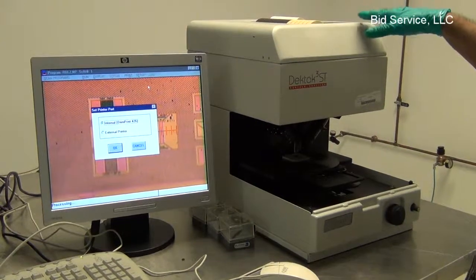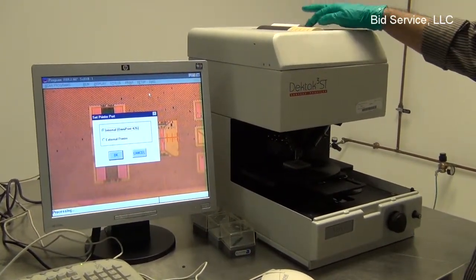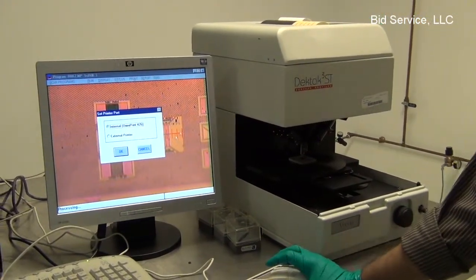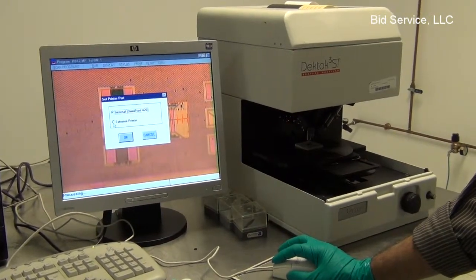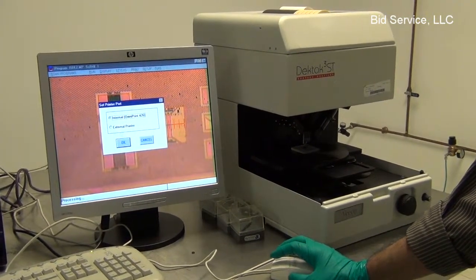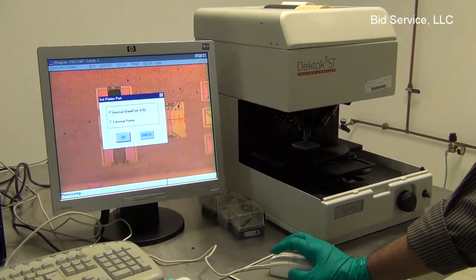This system is hooked up currently to an OmniPrint 426 thermal printer. And if there is an external printer which could be connected to the line printer port on the PC, the option is available to hook up to the external printer. But before selecting this, the proper drivers are to be installed on the PC.